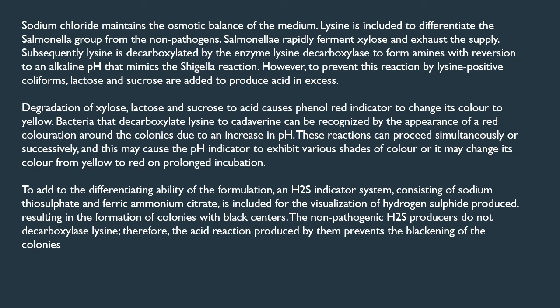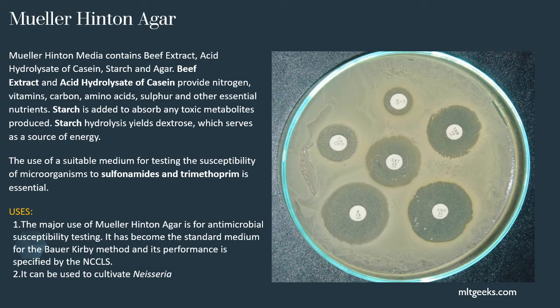Then next is Mueller-Hinton agar. Widely we use it for antibiotic sensitivity testing. Mueller-Hinton medium contains beef extract, acid hydrolysate of casein, starch, and agar.